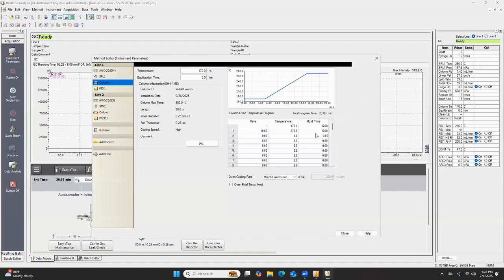It's kind of like, when you're running the IC or the LCMS, if your last peak elutes at 10 minutes, well, you have a 20-minute run time. You have that extra 10 minutes of just pushing mobile phase through, just to make sure that no contamination, no gunk is stuck on the column before you get ready to enter your next run. So the same concept applies. Okay. So yeah, that's how you input temperature ramps.